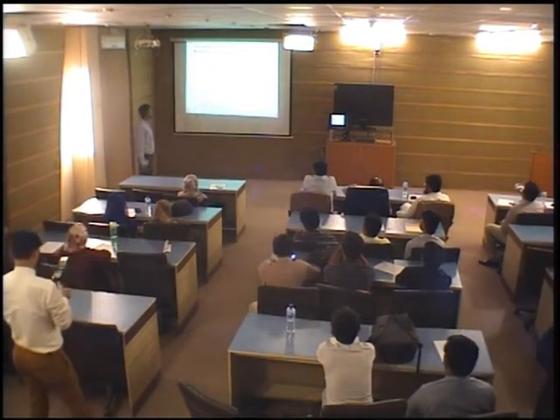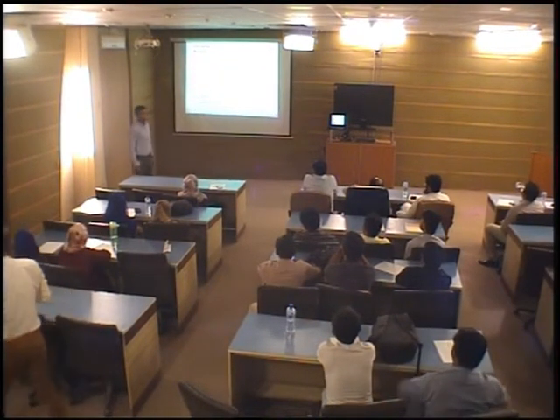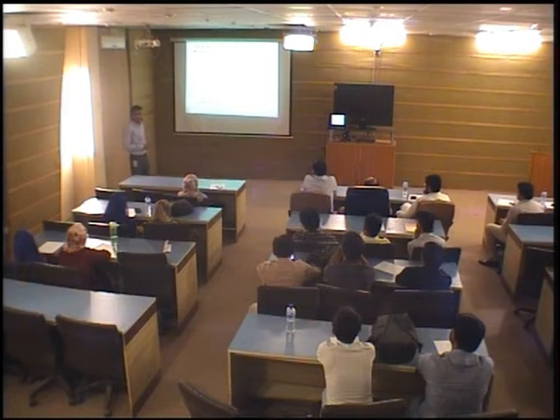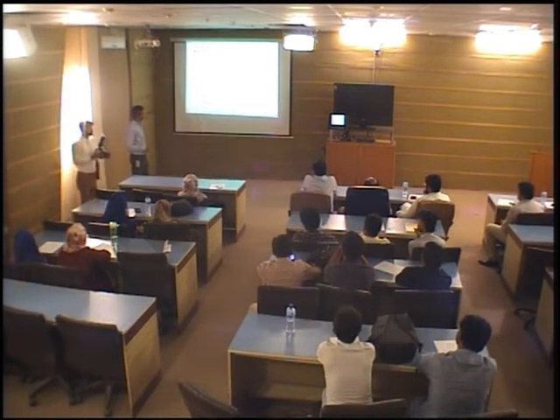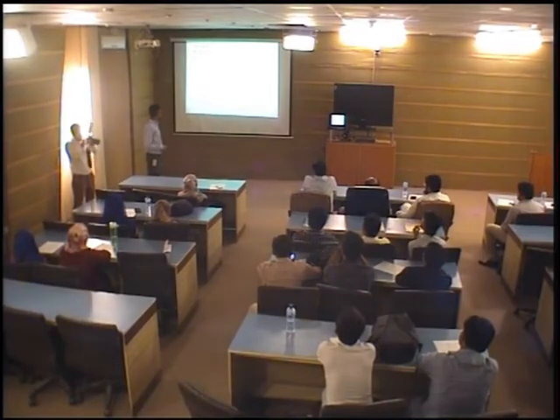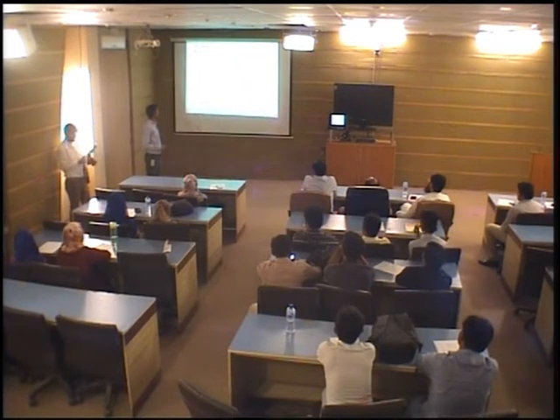Advantages of LIBS. The advantages of laser-induced breakdown spectroscopy are given below. It offers rapid analysis, requires no or very little sample preparation. It requires no contact with the sample and is sensitive to all elements. The analysis spot is very small and scalable in a sample size.